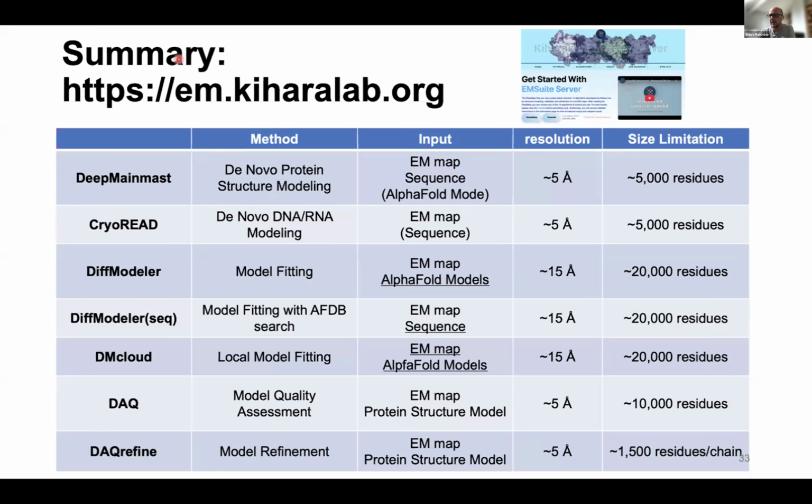Gotcha, thanks. And then I'm just curious too, is it really that we're just limited in our data set representation of some of these smaller or more unique ligands, solvents, and ions for training these models? Or is there really something more fundamental to these AI enhancement methods that leads to inconsistent results for some of the things that Mark highlighted in the previous talk?